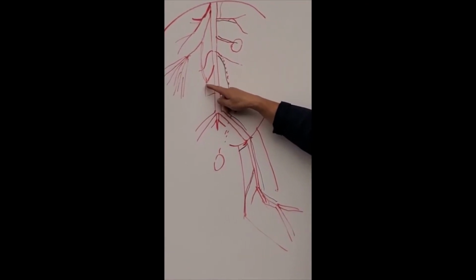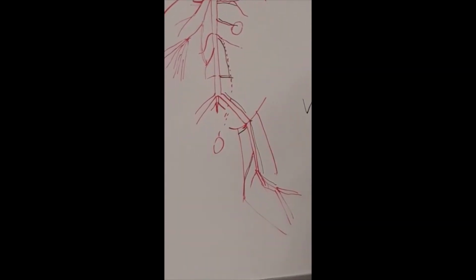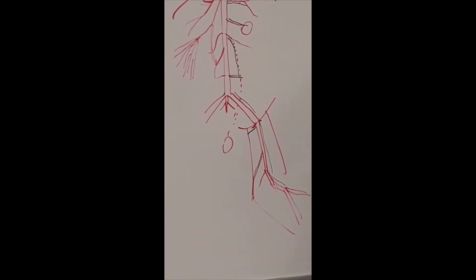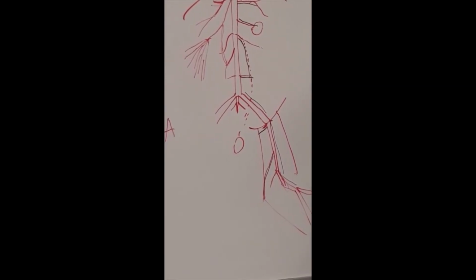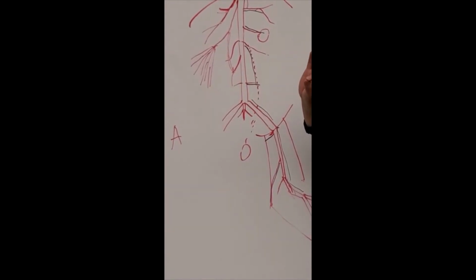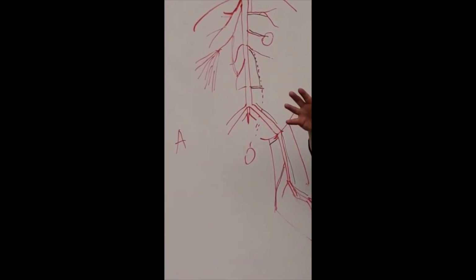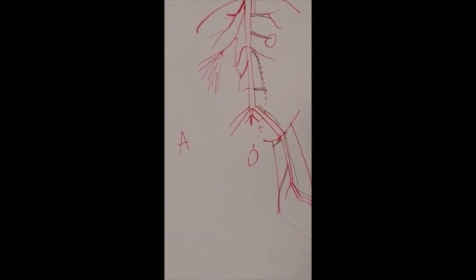Okay, supplying the rectum. Call this superior hemorrhoidal. Okay. There's like multiple branches that come from the inferior one. Just one branch. Is it like the bottom? The major one. The middle one? The major, the first branch. Okay. Later, they may have smaller branches. You don't count this. Okay.